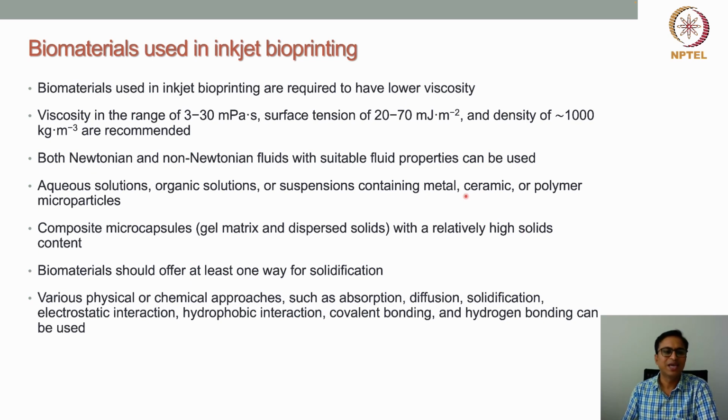Either we can use aqueous solutions, where the material is dissolved in an aqueous medium, like some hydrogel or any aqueous solution. Similarly, organic solutions, where the biomaterial or the pharmaceutical material is dissolved in some organic solvents, are also possible. And not only solutions, suspensions can also be used as a material for inkjet 3D printing.